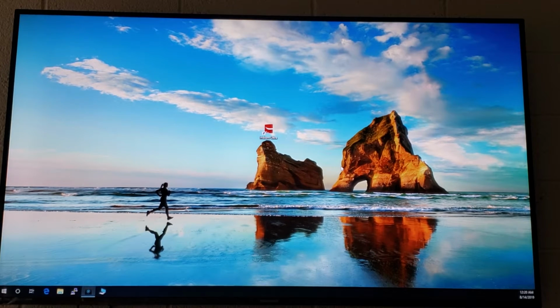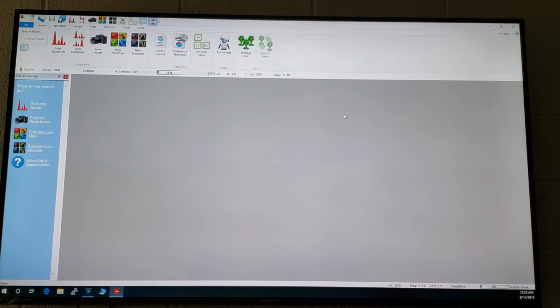We have an SEM image. We already talked about the microscope. We got it on. Beams on. Fantastic. High five. Relaunch the software for the IXRF. It gives me a little data window here just to let you guys know. So it's telling me it's creating a ribbon, it's docking, and then it pops open the software bundle.